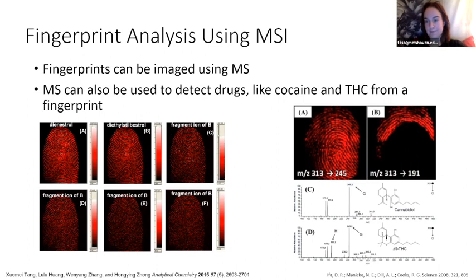Depending on the mass spec technique and its sensitivity, you could still detect THC, right? If your detection limit is low enough to detect the small amount of THC in those CBD creams, you still may see that ion, right? Now, the interesting thing with that, because marijuana is not legal in every single state right now, you may have to quantify the amount of THC to prove that it's actually CBD and not an actual marijuana sample. Right, yeah. Mass Spec is an amazing tool for quantitation if you do it right.